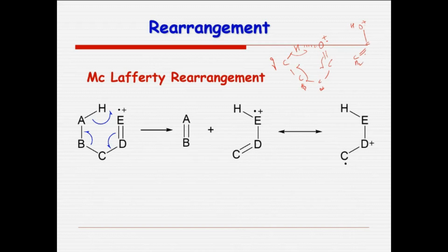So CH2 plus, you'll have the ethylene molecule going out. Suppose I have a fragment here, say an aldehyde, I'll have H here. So this becomes the McLafferty peak. Generally, an aldehyde with no substituent on this particular carbon will give you a McLafferty peak at 44.